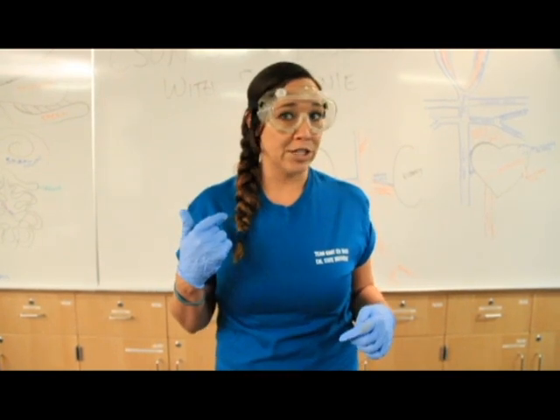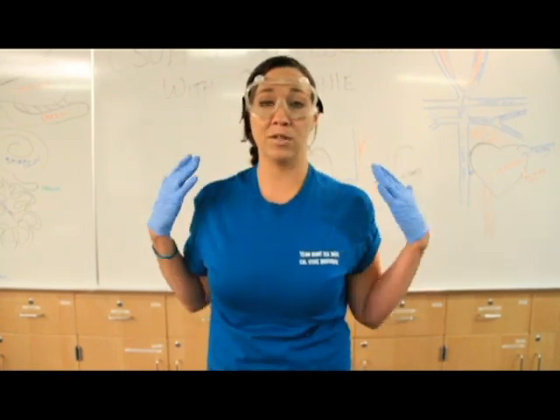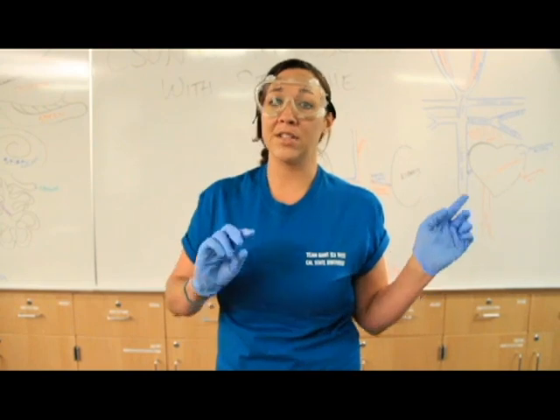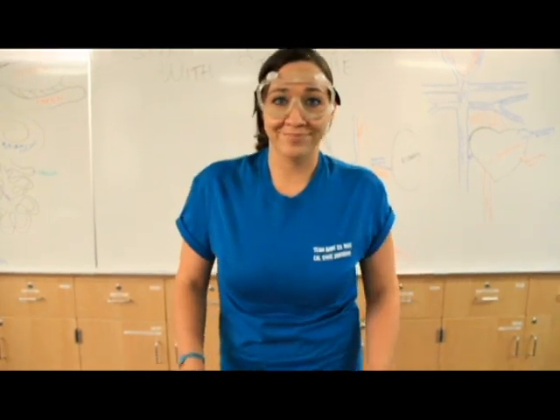You should also have your hair tied back in case you want to lean forward. The hair does get in the pig sometimes, so you want it nice and pulled back and out of the way. You also want to make sure that you have your gloves on, and again, these gloves never leave the classroom. So let's go ahead and get started with the external anatomy.